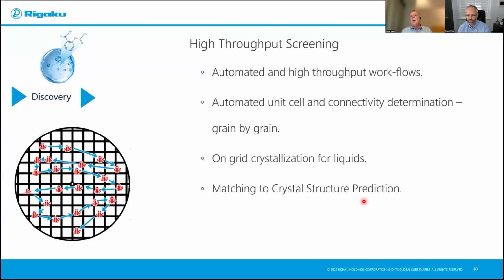They give you a lot more metastable crystalline forms that you may never see again downstream after you've gone through purification. So this is an incredibly important contribution that electron diffraction makes to the whole pipeline, and it can shorten the development and make you a lot more confident that you found the most stable solid form.